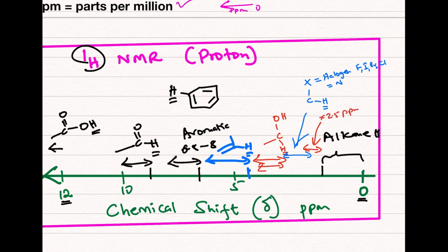And that's basically for what we call the allylic position, allylic protons. Allylic protons are when you have a double bond and then the next carbon. So if that carbon has a hydrogen, that will be the allylic position. This position on the double bond is the vinylic position. So this position is vinylic. And then the next carbon becomes the allylic position.